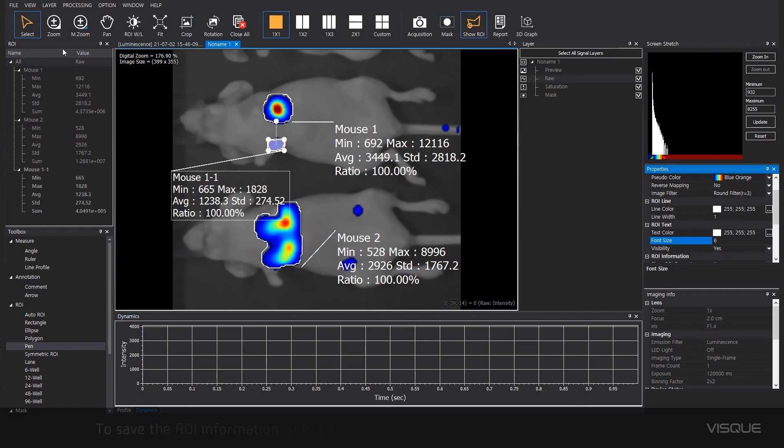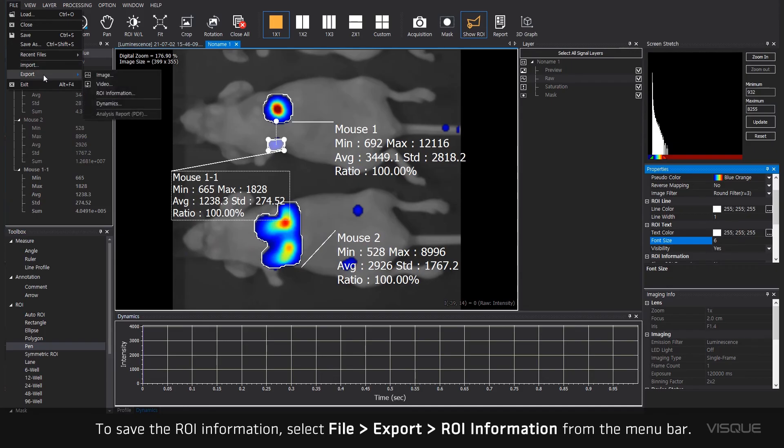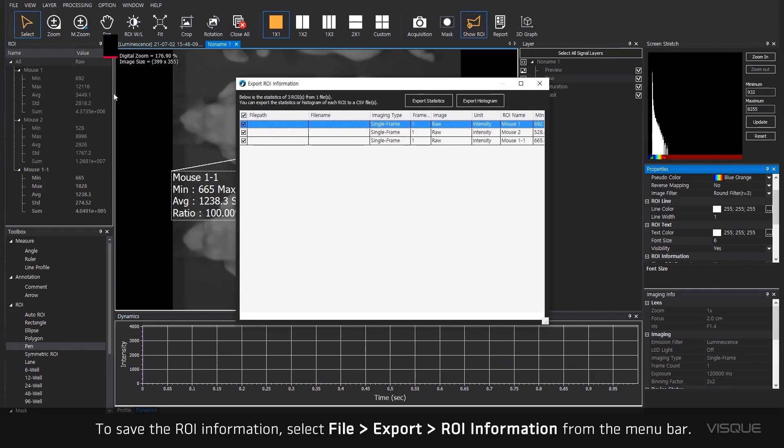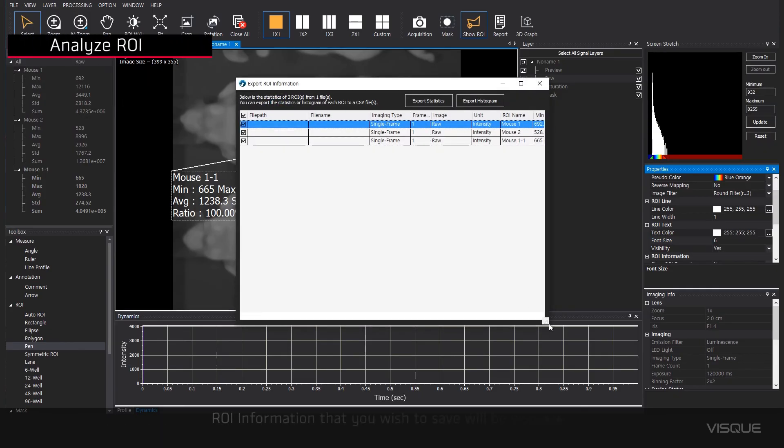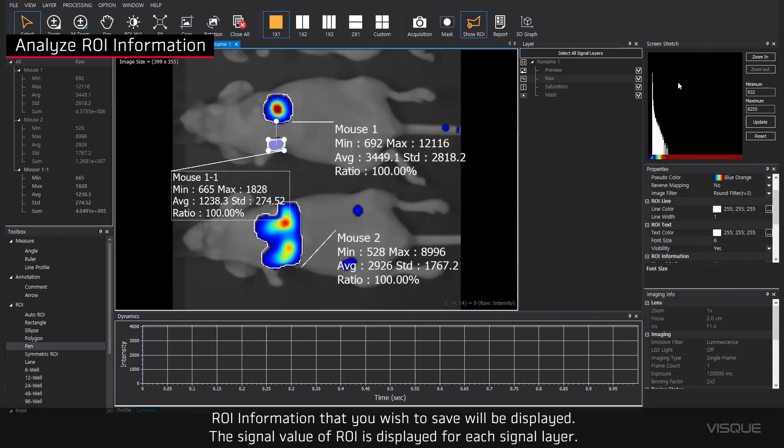To save the ROI information, select File Export ROI information from the menu bar. ROI information that you wish to save will be displayed. The signal value of ROI is displayed for each signal layer.